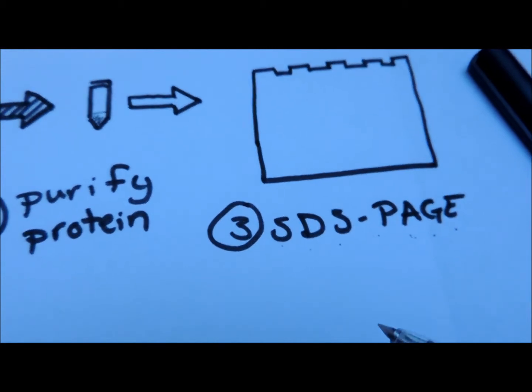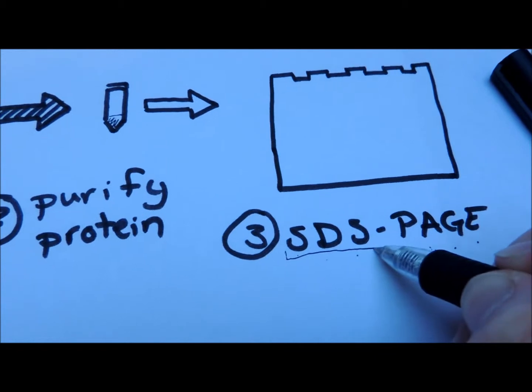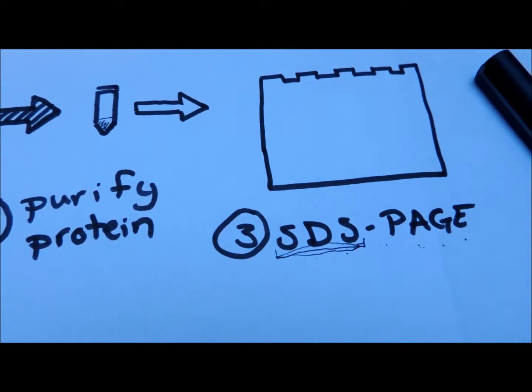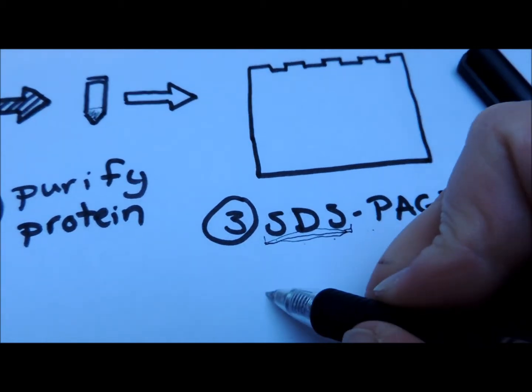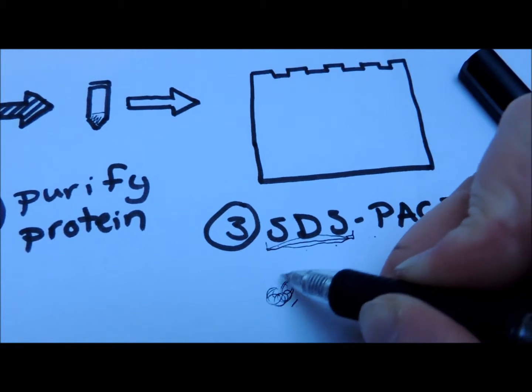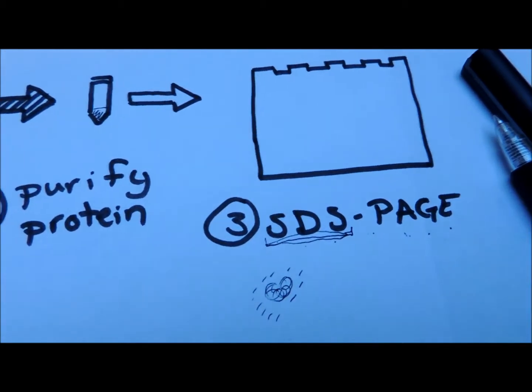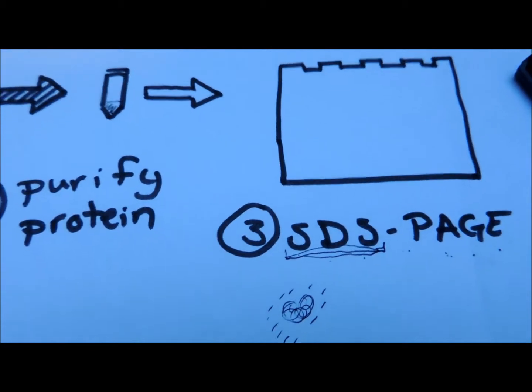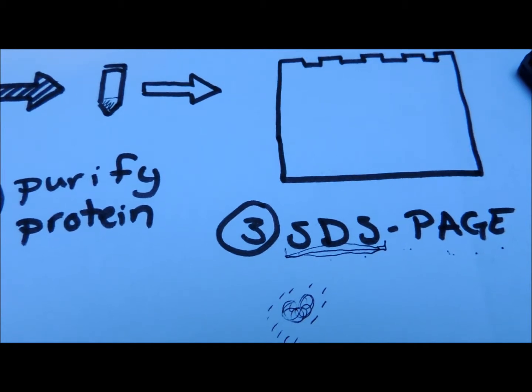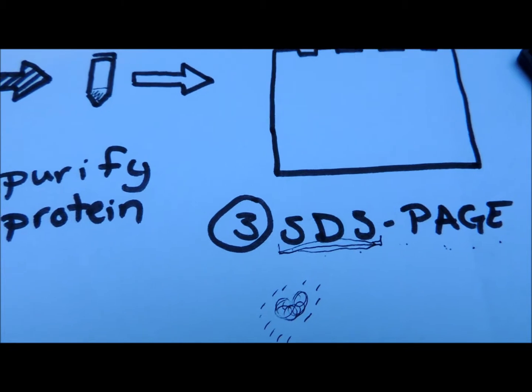And all of that basically sounds very fancy, but what it means, this SDS part, SDS is a chemical that will coat proteins. And it'll coat them in a negative charge. So if you had a protein like this, it would give the outside a nice strong negative charge. The reason we might be interested in something like that is because once you have a charge, we can use an electrical current to help separate you from other components of a mixture.